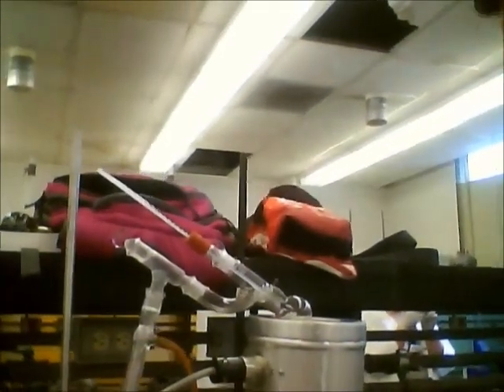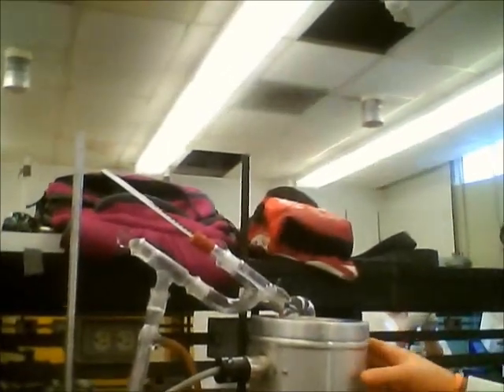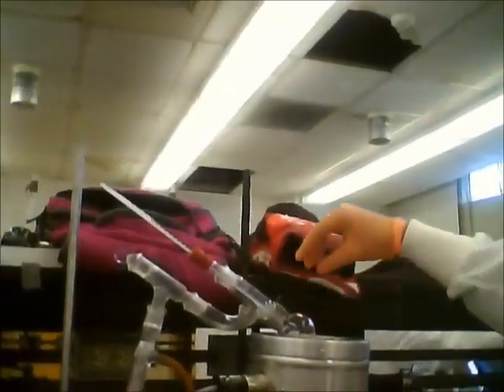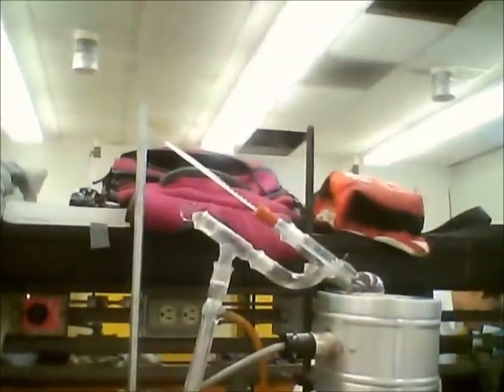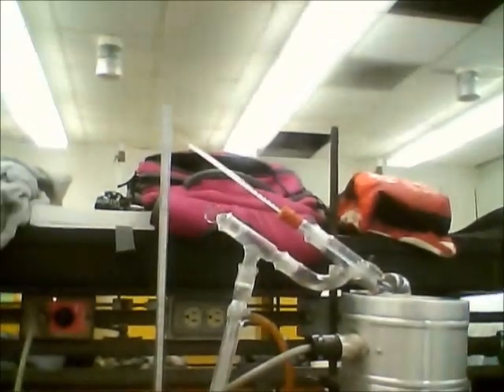This is the setup for the short path distillation. We've got the heating well right here, we've got the pot, and right above that we have the Kleisen adapter. We have the thermometer, and we also have the condenser, which is a safety feature. There are some tubes coming out of there — it's connected, just running water through it — a beaker and the two vents.